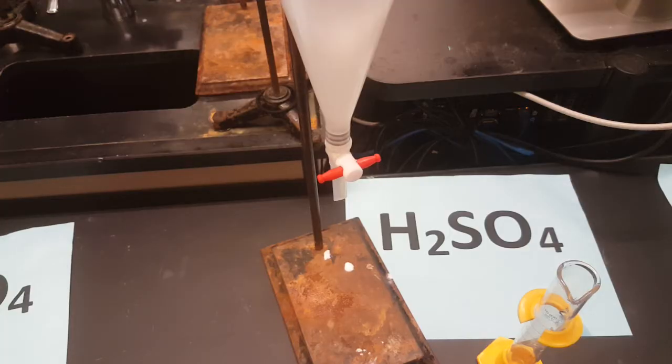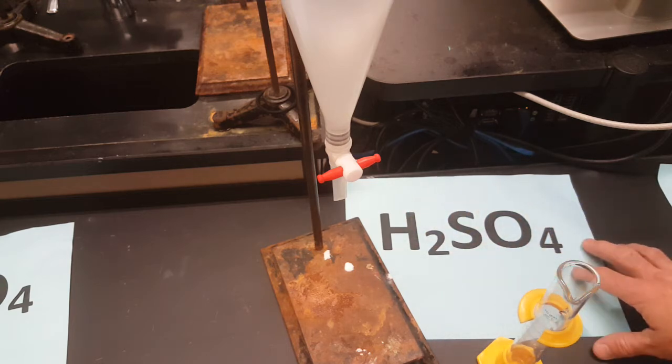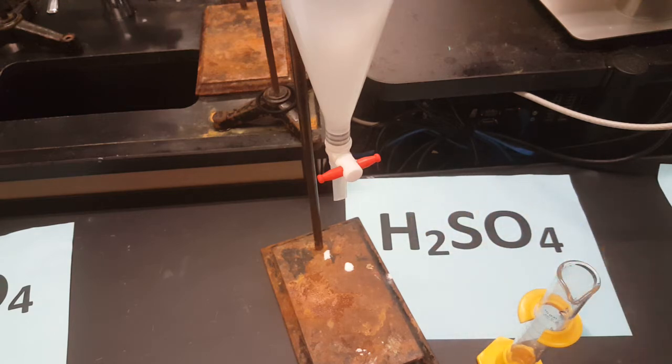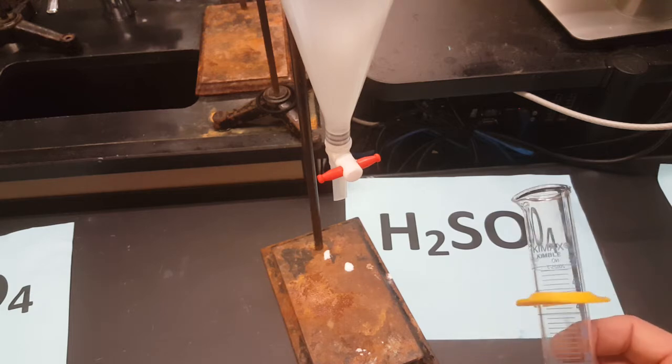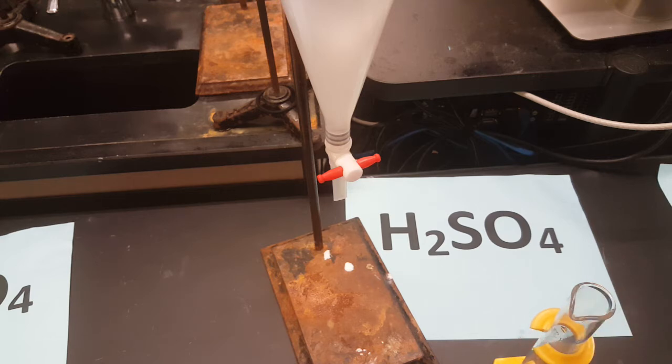Here I am at my sulfuric acid station, and notice there's no molarity written for this. Let me reiterate. The purpose of a titration is to find the unknown molarity of an acid or a base using the known molarity of a base or an acid. So in this case, for this lab, we know the molarity of the base and we don't know the molarity of the acid. And you've been asked to retrieve 25.0 milliliters of sulfuric acid.